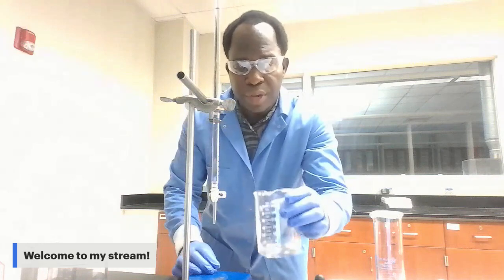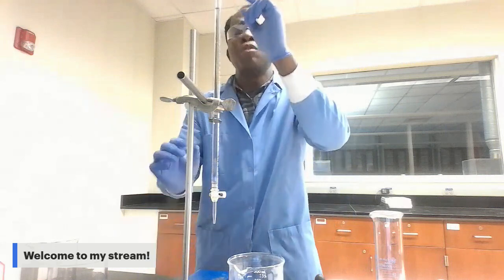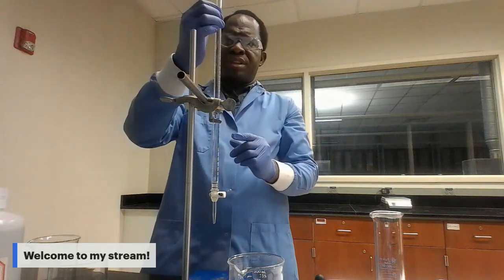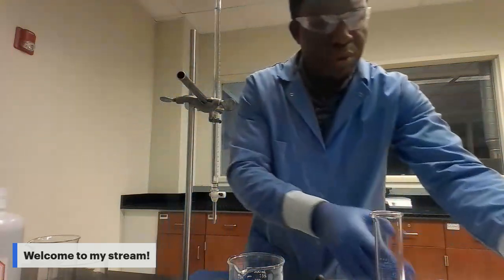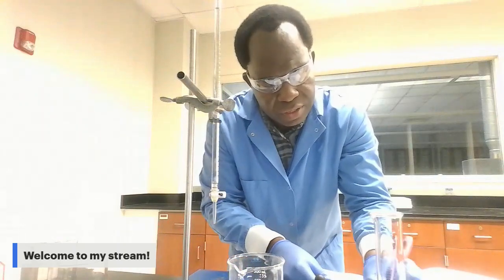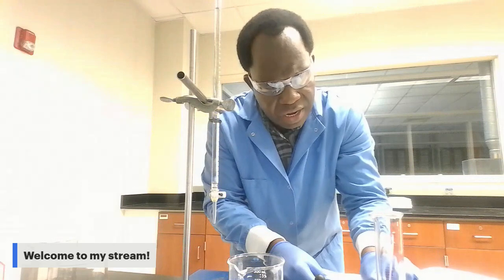So when you get to the equivalence for the first CaOH2 solution, you have to read the volume of HCl you use for that titration. Mine is showing 15 milliliter. So you should have your notebook on the side. We start from V 0 milliliter to volume of HCl 15 milliliter.